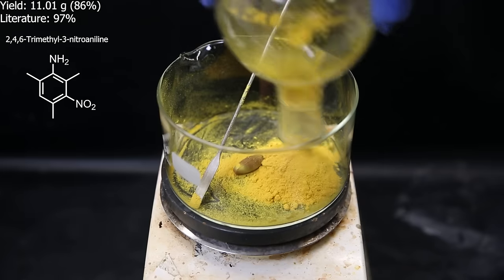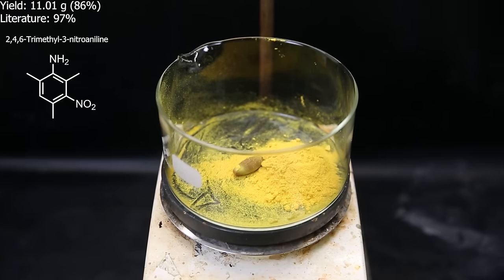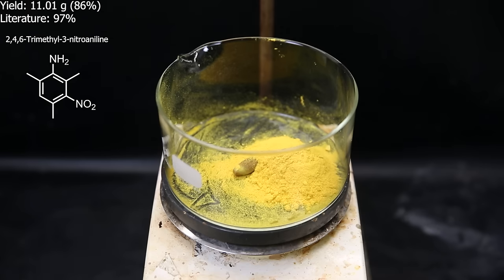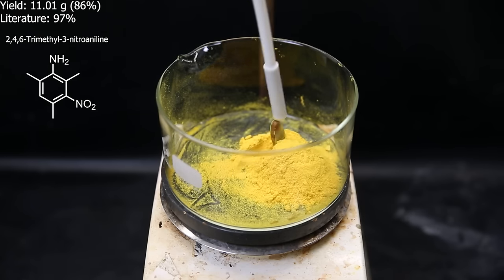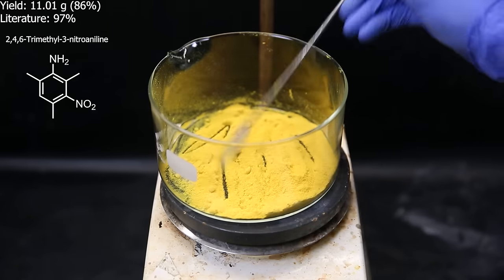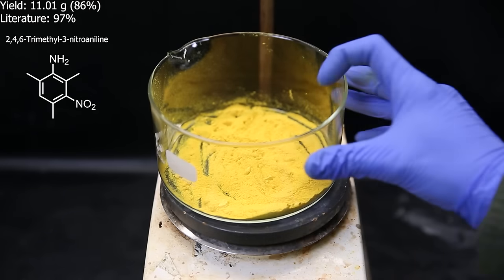I then pour it all back into the crystallizing dish, and the yield turned out to be 11.01 grams, which is 86%. It's a pretty decent yield, that is close to literature, and so the first step is now complete, and I will use this product right away for the next reaction.